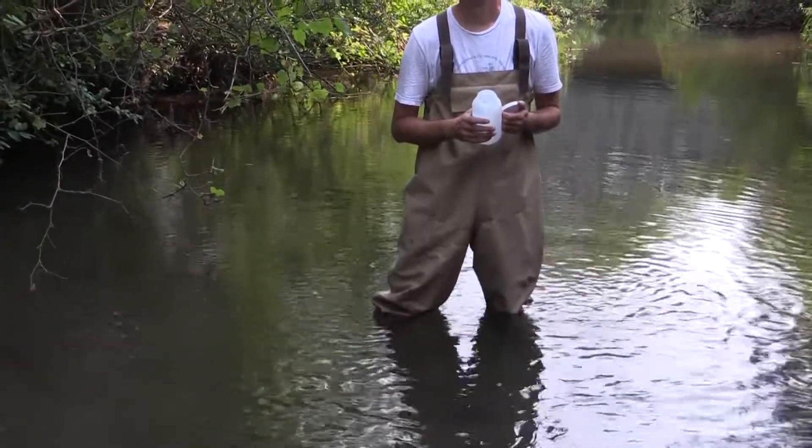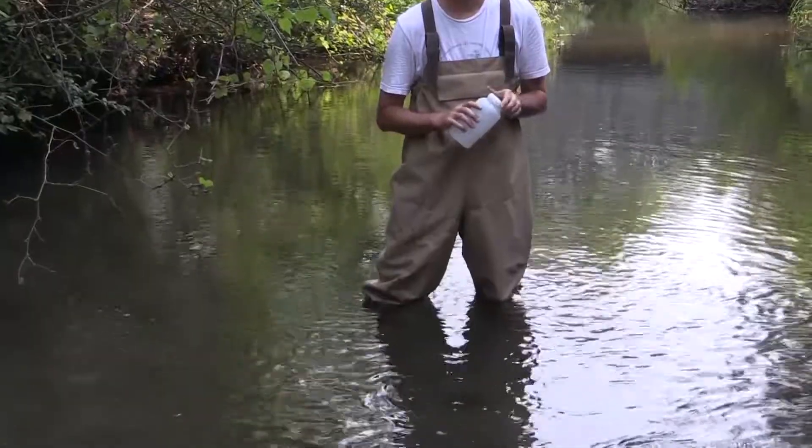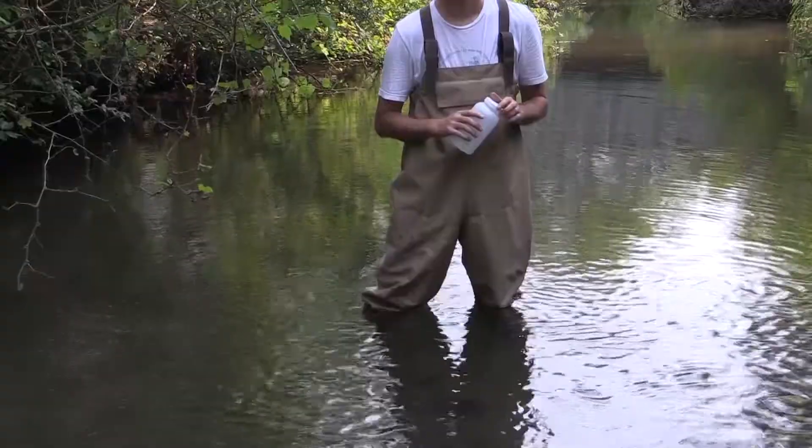If there is no apparent flow, please check with an HRWC staff member if a sample should be collected. Make sure you are faced upstream with the water flowing directly at you. Wait for a few seconds to ensure all sediment from your steps has settled to the bottom.